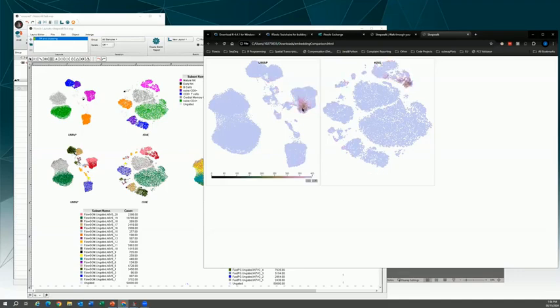whereas in UMAP space, we lose some of that fine-grained local structure. We do see that this lower half of the lobe agrees with what we see in high dimensional space. And once I come up here, we only see events highlighted in this upper region.